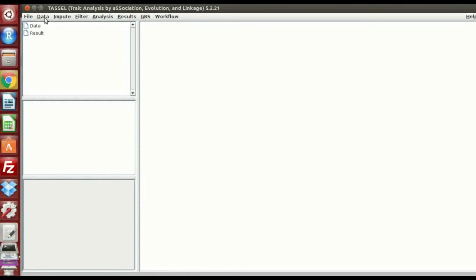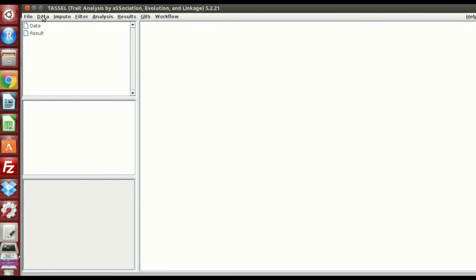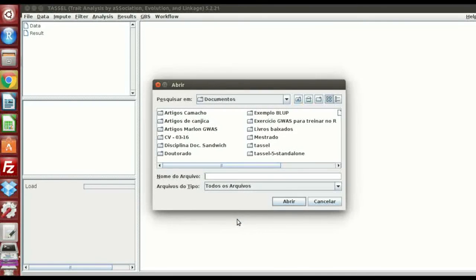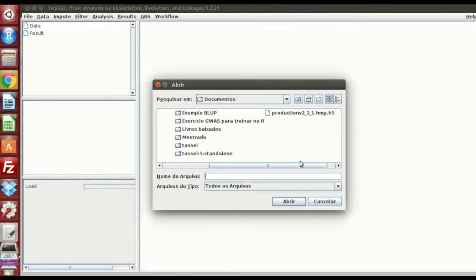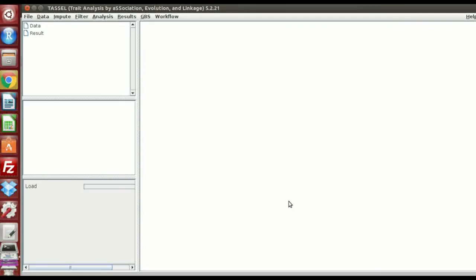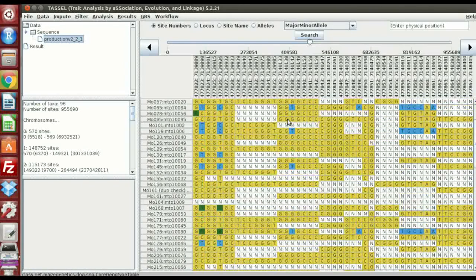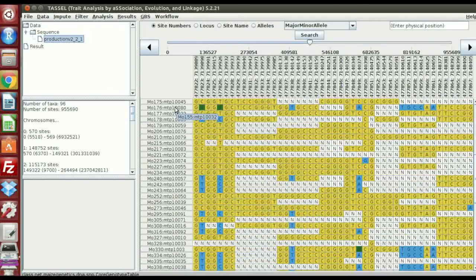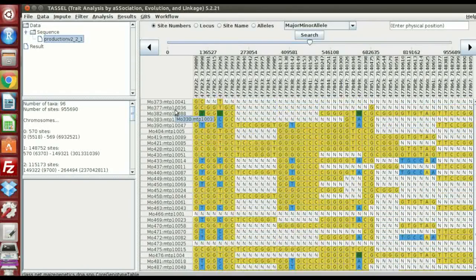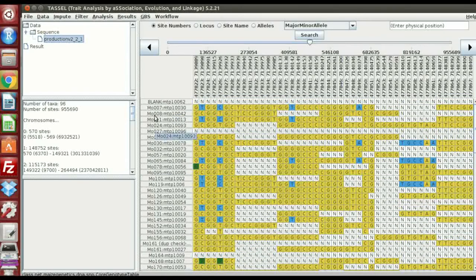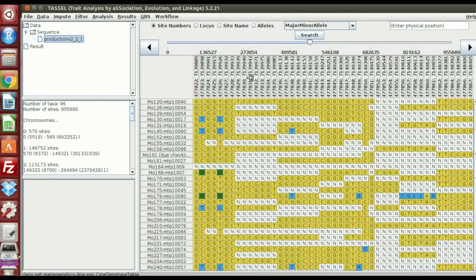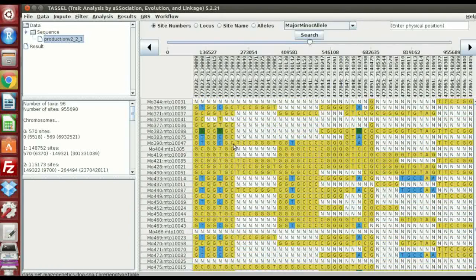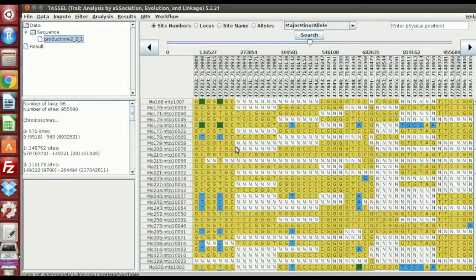You can... Now we're going to take a look in that file we got. You go to data. And load. And load HDF file. So we're going to open this file. Production2. That's the name I gave. This is how it looks. You have the SNP information for each of the individuals. Your genotypes are here in this column. Each line is a genotype and the columns are the SNP position.